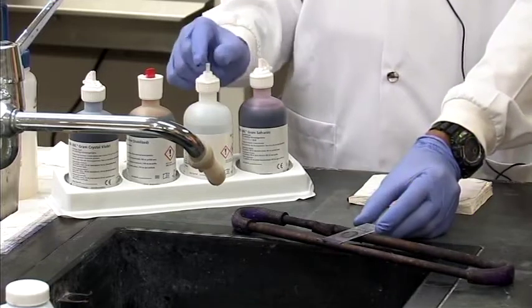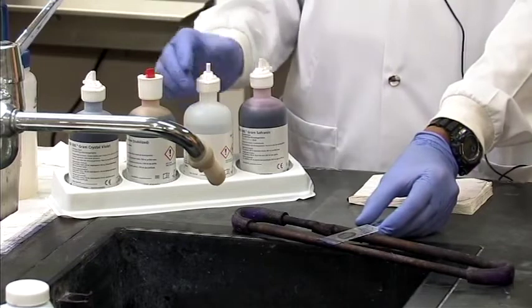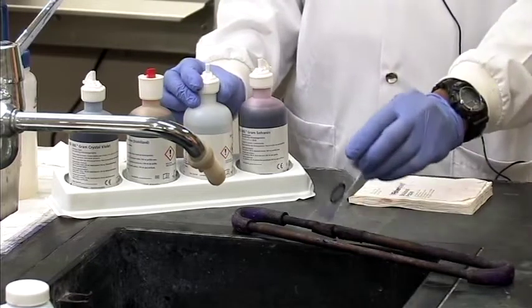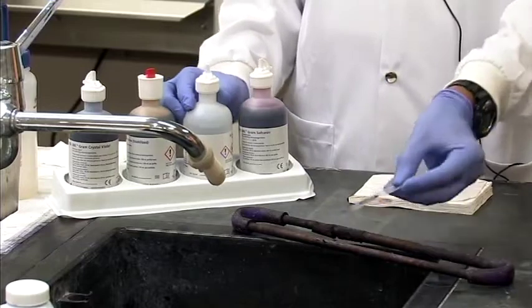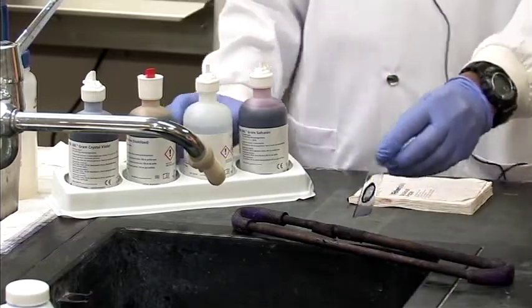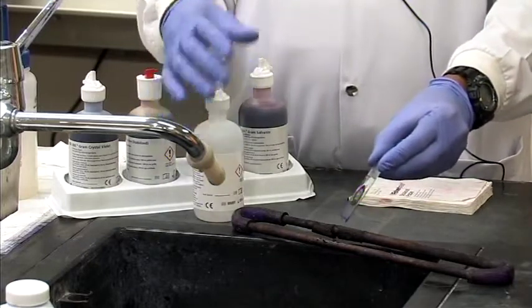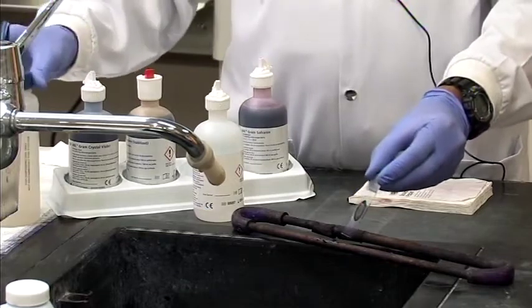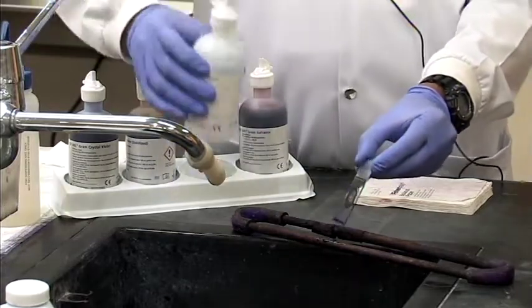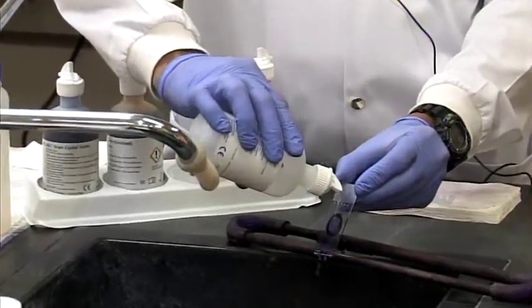And that's why it's important to have a very thin smear when you're making your smear at the beginning of the procedure. Now, to decolorize, you cannot leave the slide flat. You have to hold it upright at this angle and apply the decolorizer drop by drop until the blue color washes off. And it just takes sometimes a few seconds. So hopefully you can see this. I'm going to apply drop by drop of your decolorizer.